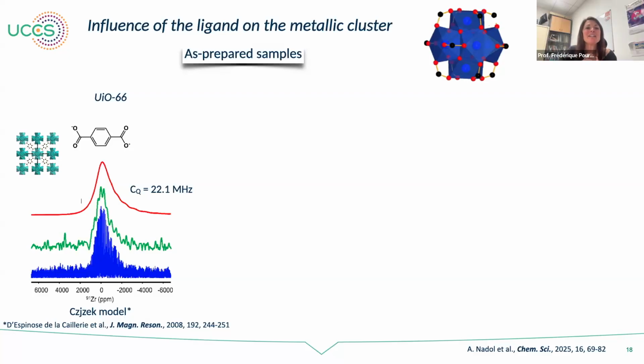I did carbon-aluminium experiments in these kinds of systems, but we usually need a spin-half nucleus in between the electron and the quadrupolar nucleus. It's easier for me because I do have access to high field.